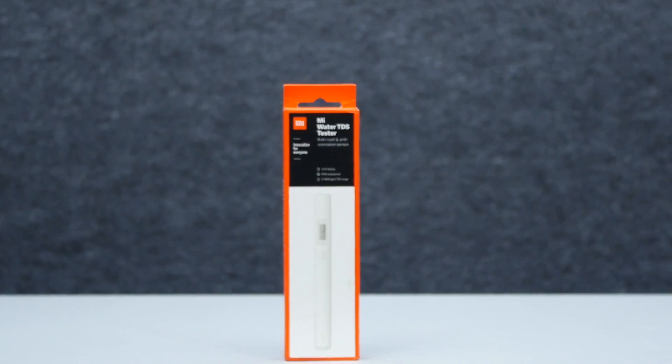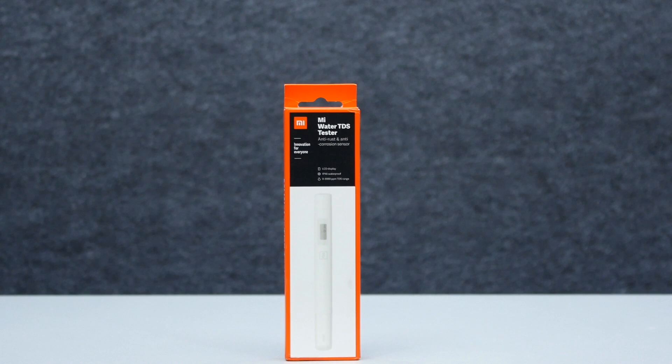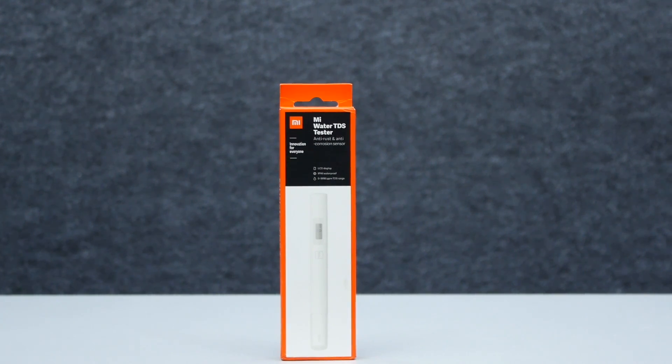Welcome viewers! Let's talk about the MI Water TDS Tester. This is an unboxing plus a first impression, and we can try to test it live.